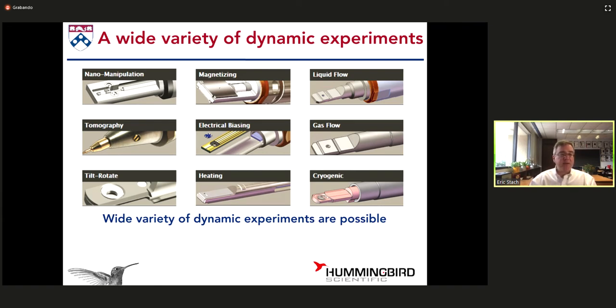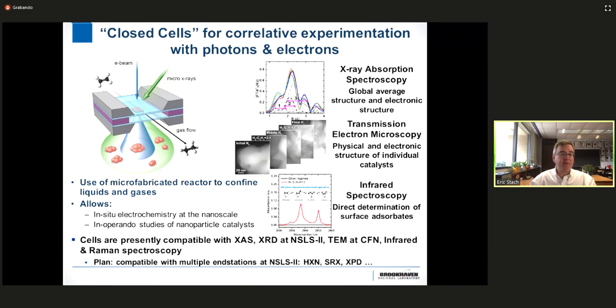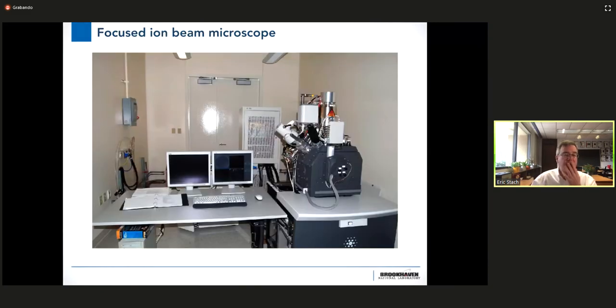So as I'm looking at where we are, I'm going to finish off with one small section that's important. It didn't fit in anywhere else, but I want you to know a little bit about this, and that's the idea of how we make a sample. I've emphasized throughout that we need very thin samples. That's a special challenge, because not all samples want to be thinned to the 10 nanometer to 100 nanometer range.